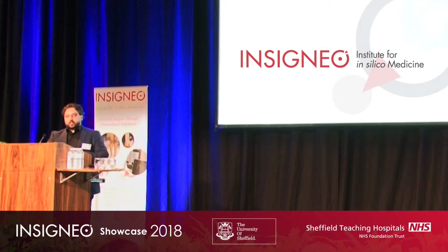Strain measurements in bone can be done in different ways. We can attach a sensor like a strain gauge, which you have on the left-hand side. That is a surface sensor, a few millimeters in size, and it's a very accurate measurement, but we need to attach it, we need to open up the tissue, and even for ex vivo applications, it's relatively invasive. In particular, if the bone we want to measure the deformation of is tiny, like a mouse bone.